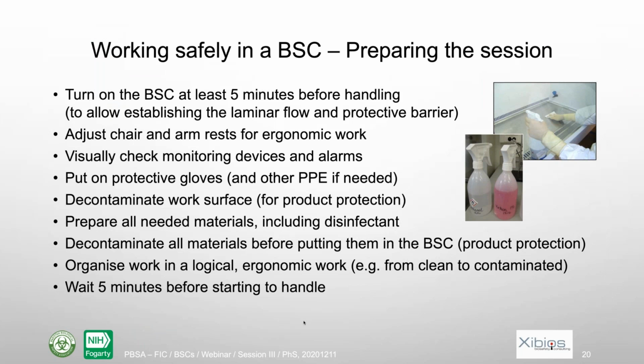Usually those SOPs have three parts. The first one is on the preparation of the work session. The second one is on conducting the work session. And the third one is on ending the work session.